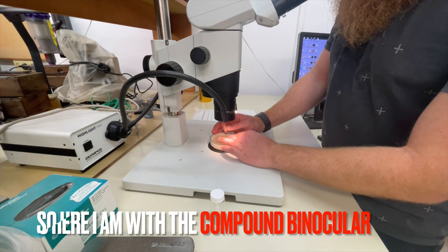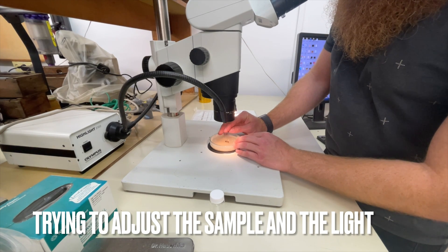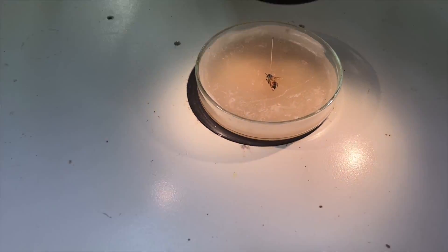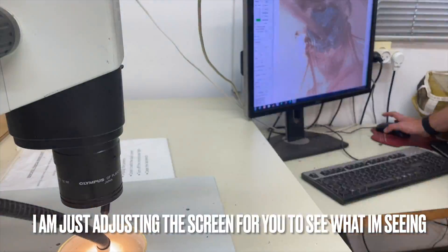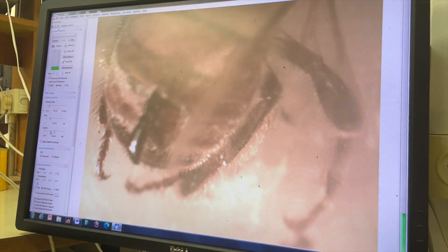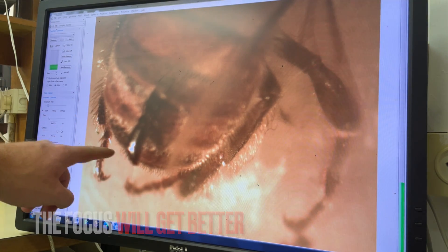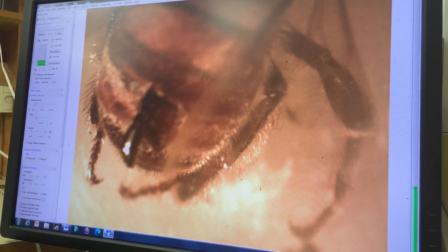So I decided to take it inside and take a closer look. Here I am adjusting the sample — the bee has died — and I'm adjusting the sample with the compound binocular microscope. This is how it looks before we start magnifying. I connected the screen so you can see what I'm seeing. I'm sorry if the quality is not great — the focus will get better soon. This is the black thing I talked about earlier, and this is what I want to dive into deeper.